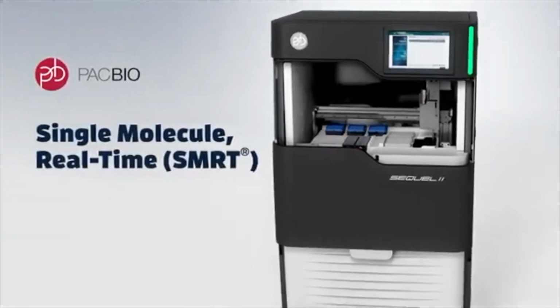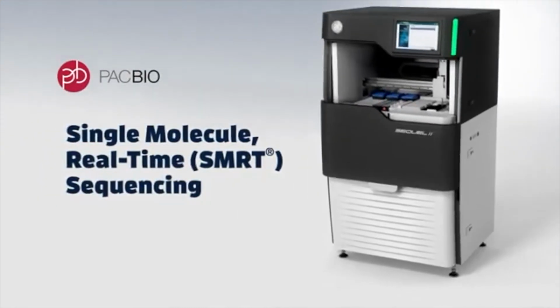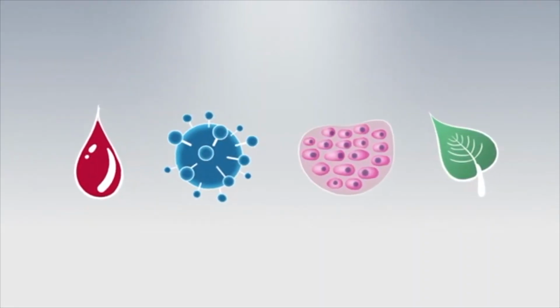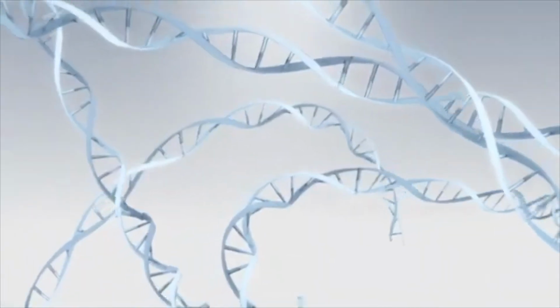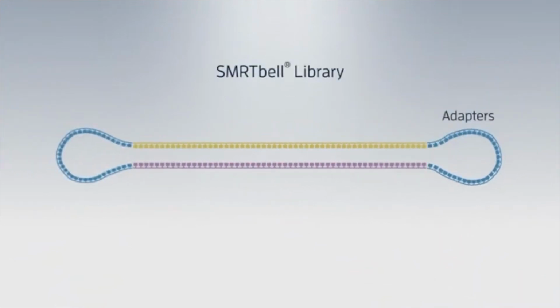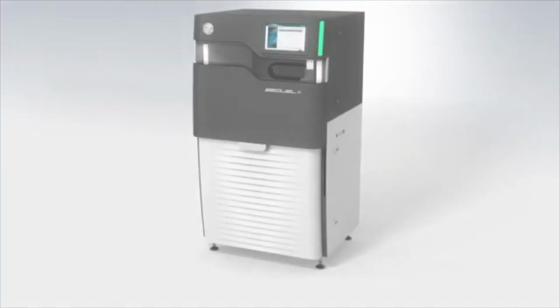In order to provide an example of a sequencing machine, we present the PacBio sequencing tool. This sequencing machine is powered by single molecule real-time, or SMRT, sequencing, and it can take any sample type, ranging from viruses to vertebrates. SMRT sequencing works by ligating adapters to the extracted and isolated double-stranded DNA sample. This is to make a circular template so the polymerase can work continuously.